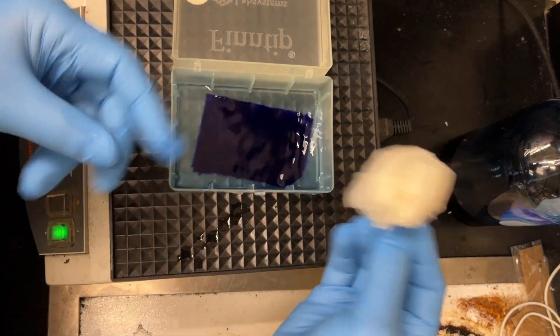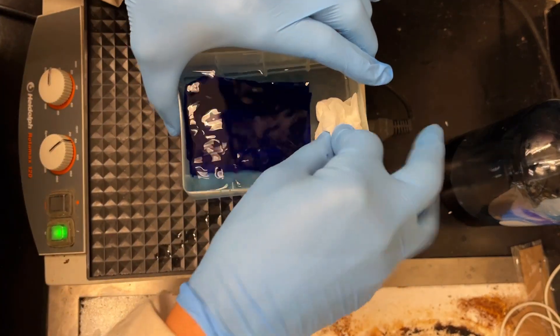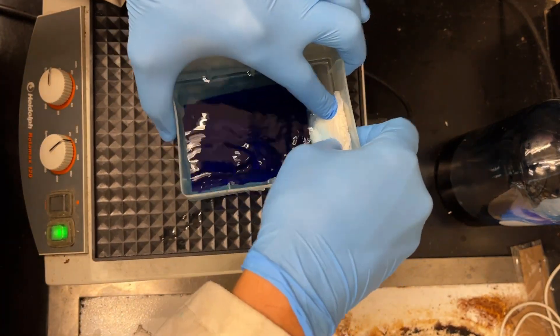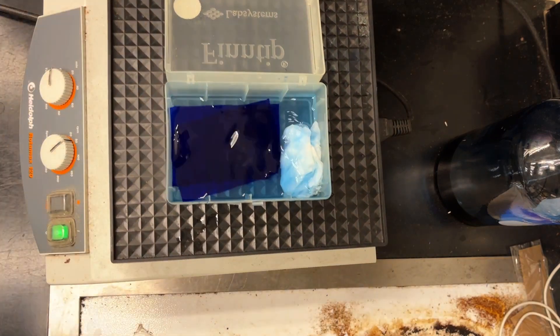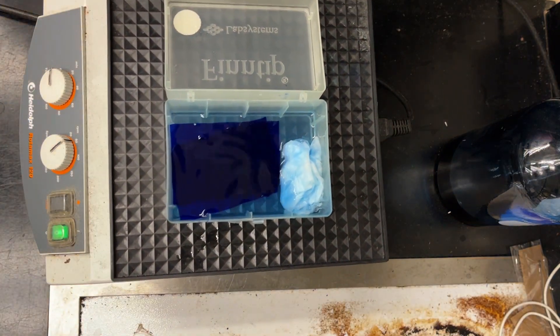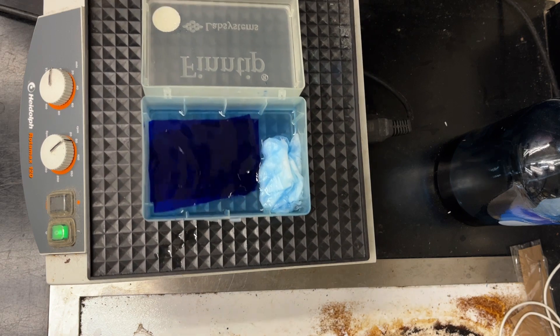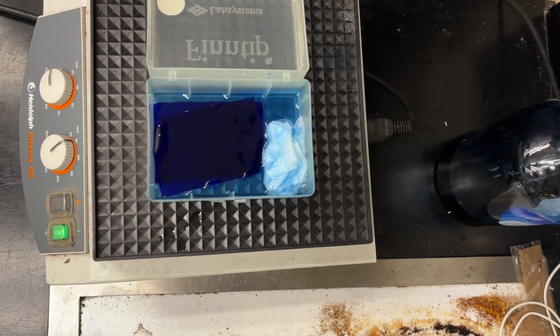And look how blue the gels are. Now, to help with the decolorizing, what you can do is stick a little bit of a wad of Kimwipe in the corner. And the Kimwipe, as it sits there, starts to absorb the blue color, removes it from the decolorizing liquid that it's sitting in, and it just helps speed up the process.